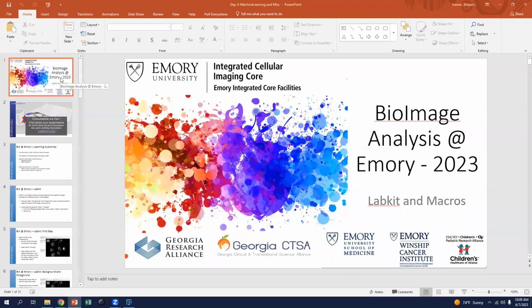All right, let's begin. Welcome everyone to our last, third day of the Bioimage Analysis at Emory seminar series. Today we're going to cover using Labkit for segmentation as a machine learning model and the introduction, and I stress the introduction part of programming macros in Fiji, as well as some tools that'll make it easier, and I link some resources in the presentation for those of you interested.